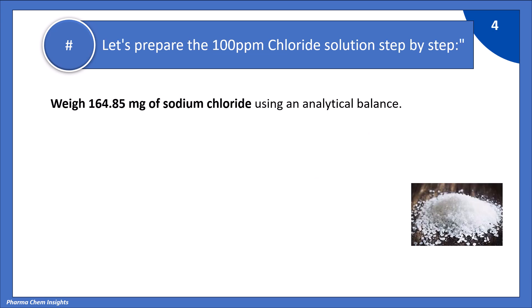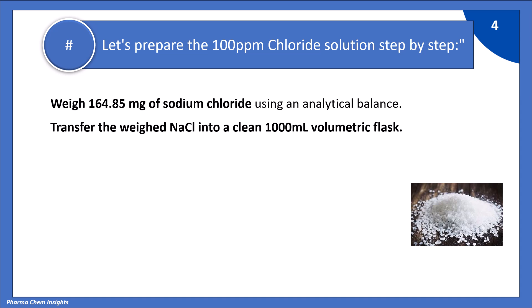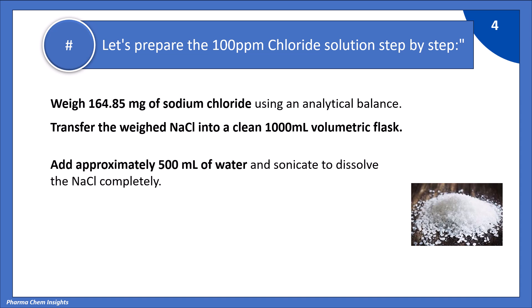Let's prepare the 100 ppm chloride solution step by step. Weigh accurately 164.85 mg of sodium chloride using an analytical balance. Transfer the weighed NaCl into a clean 1000 ml volumetric flask. Add approximately 500 ml of water and sonicate to dissolve the NaCl completely.